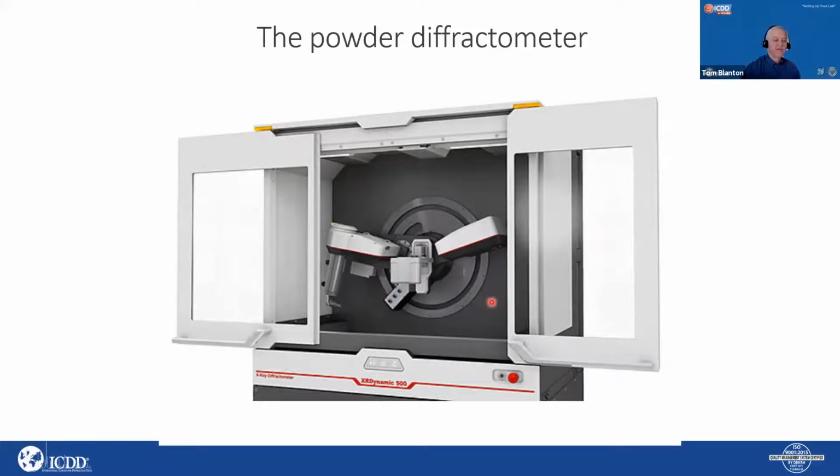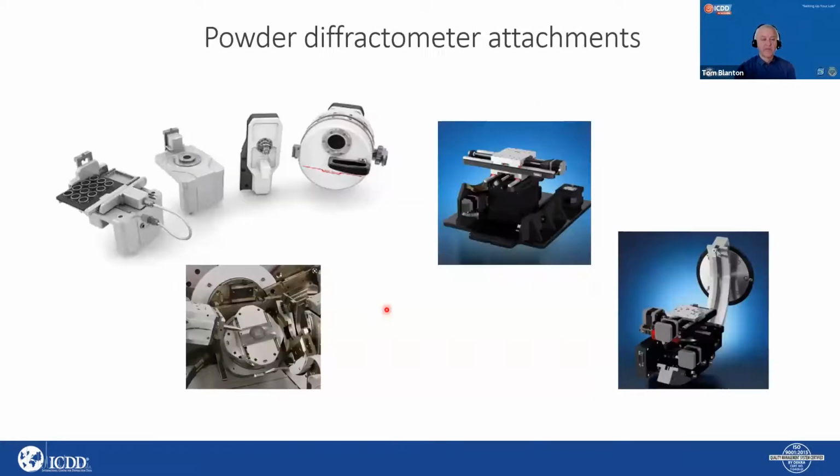In the design of a lot of the current instruments, you'll see the source, sample stage, and detector on what I will call the front side of the radiation enclosure, and on the back side, the actual stage and motors where the instrument components are attached. You'll find that they're in some kind of radiation enclosure, and typically it has leaded glass so that you can see what's going on with the instrument but still be protected.